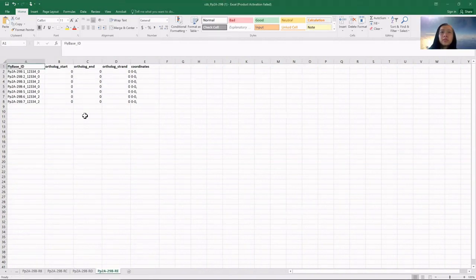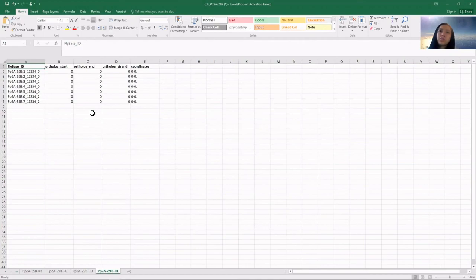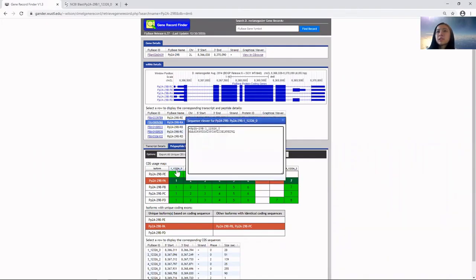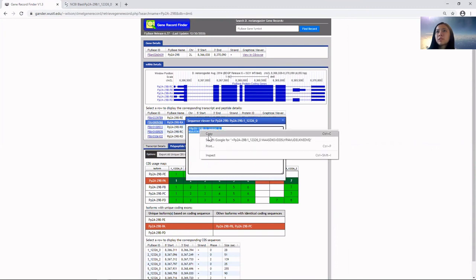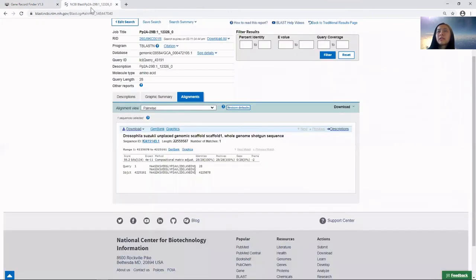This template is optional to use for keeping your predicted and/or final coordinates while annotating your gene. For example, I'll use CDS1 as an example where I copy and paste the sequence, run the tBLASTn, and this is the result.